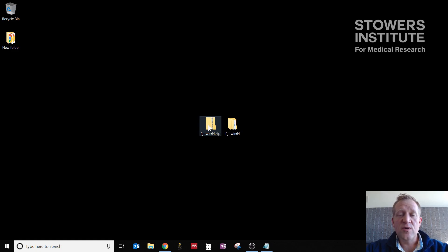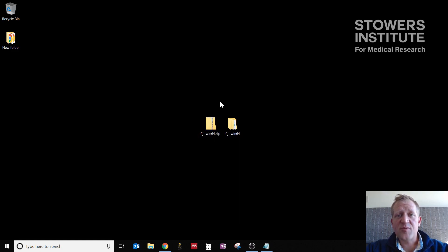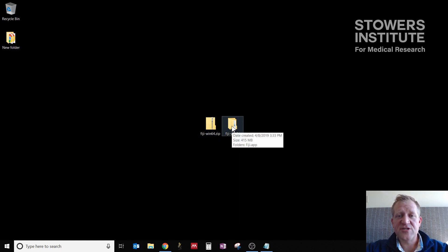You want to extract that using whatever program you prefer. So if I right-click on that, I can click extract all. That process gives me a folder here that has Fiji installed.